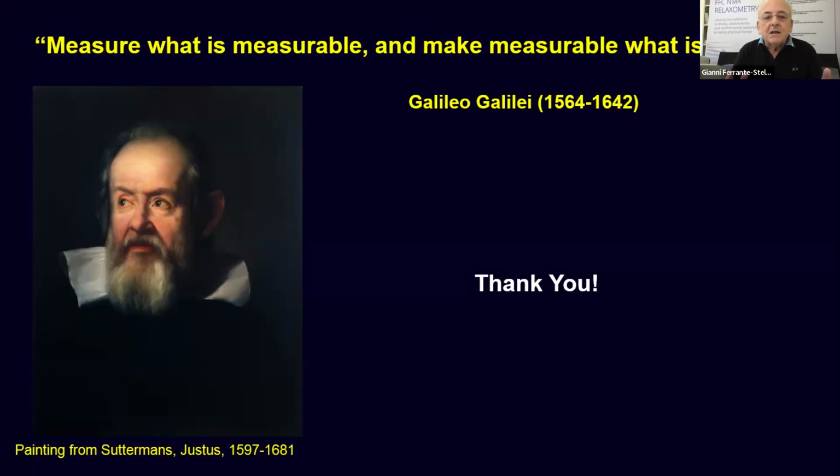But before doing this, it's completely important to check other situations like signal to noise. In the middle of the NMRD profile, we know that we have low signal to noise. And this is crucial. Signal to noise, I believe, is driving anything here. So we are trying to make some kind of protocol recommendation. Nothing can be automatic, because what you have done is very much based on your experience, grown in years.